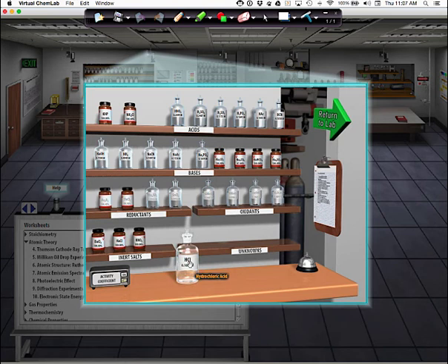Then guys, step 6 says place the sodium hydroxide bottle on the counter. There you go. And now you've got your two substances. Now guys, just so you remember, we are going to use this as our standard. We're pretending like we don't know the concentration of the acid. This is going to be our standard.